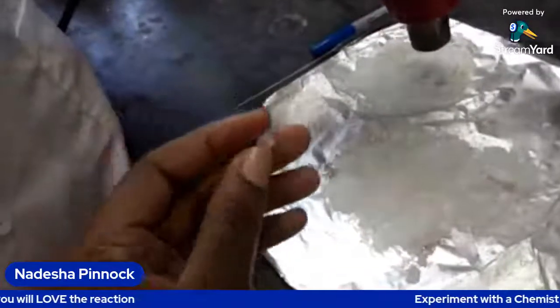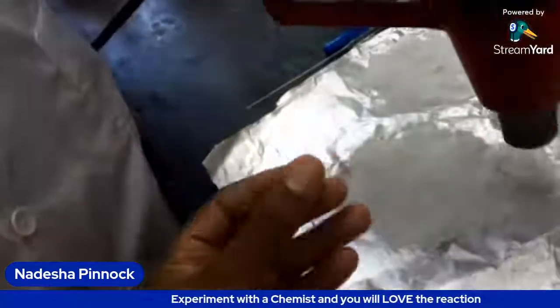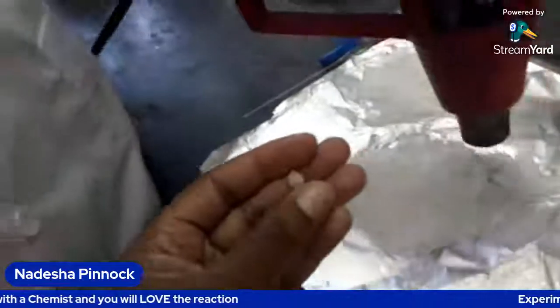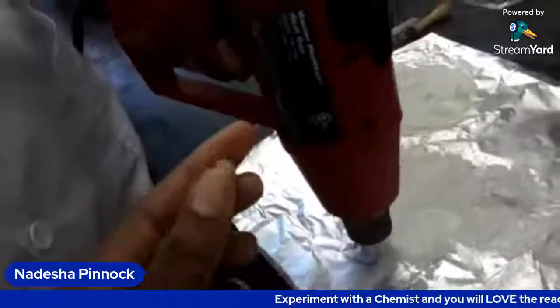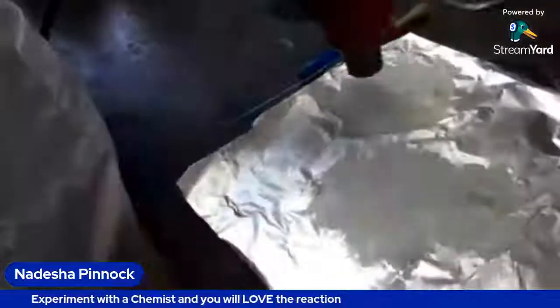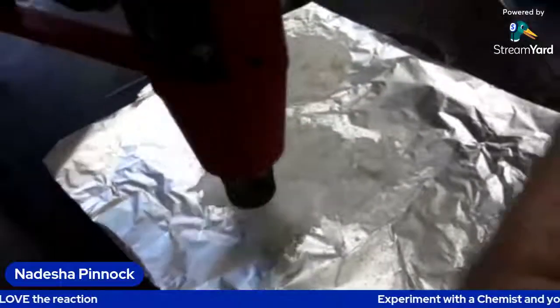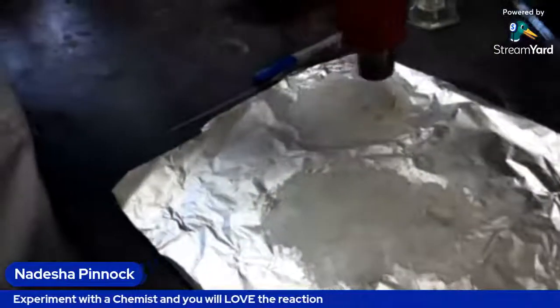All right, so this is the little piece that just went dry. See how it's easy to roll? It should be like this when you're finished. Easy to mold. Not too hard, but remember that the more glycerol you add, the more flexible it is. So if you want a harder plastic, then of course you add less glycerol. It does smell like plastic burning, honestly.